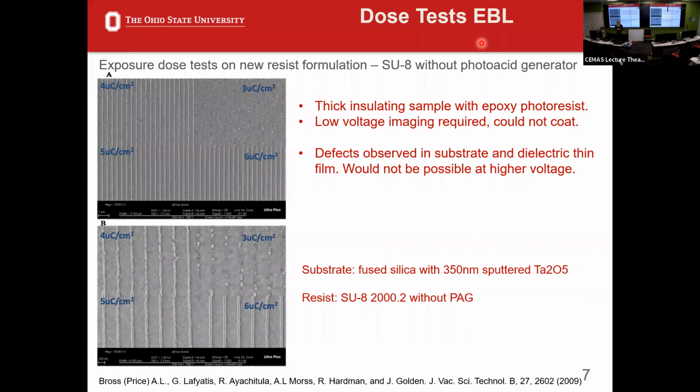So this was actually one of the major reasons that we had to have an electron microscope in the lab, because we were able to produce something, but we couldn't evaluate it. It was too small for any of the techniques that we had. In this case, I picked this example for several reasons. The resolution isn't super high. It's not very small features.